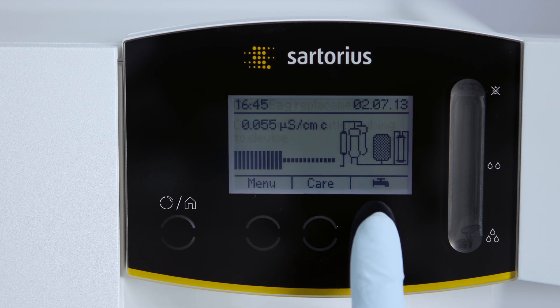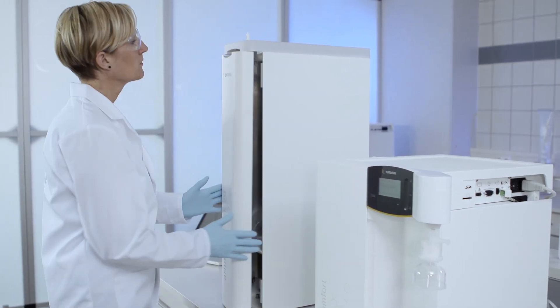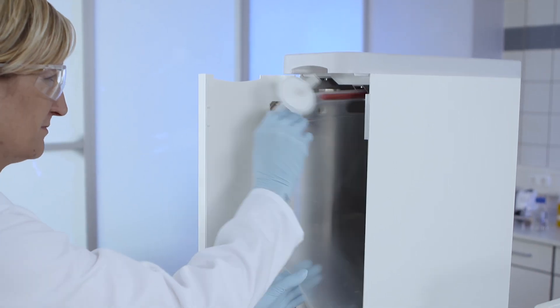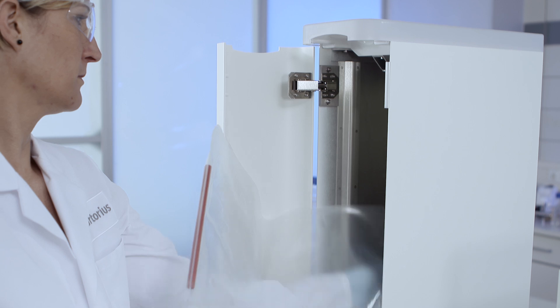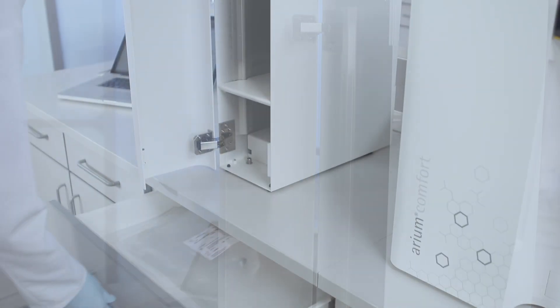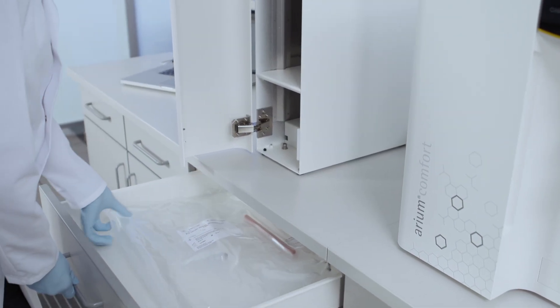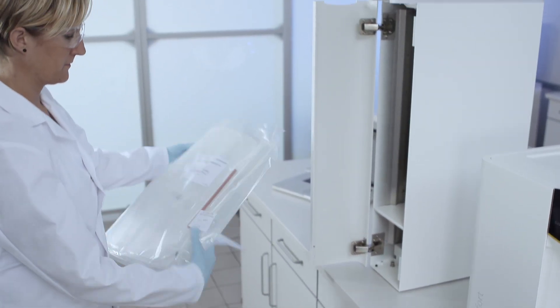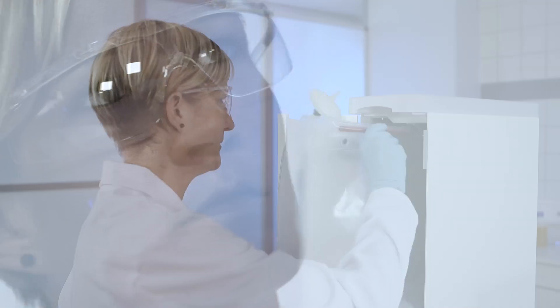Don't just save time, but also money and use the REM BagTank system. Discover the perfect solution for the optimal storage of pure water. Thanks to the integrated single-use bag, which was specifically designed for the pharmaceutical industry, the REM BagTank system facilitates the efficient and safe storage of pure water over long periods of time.